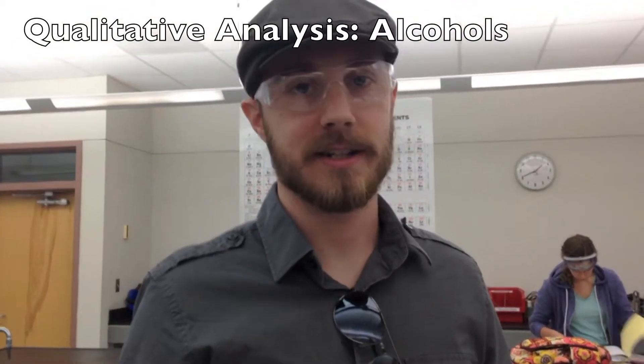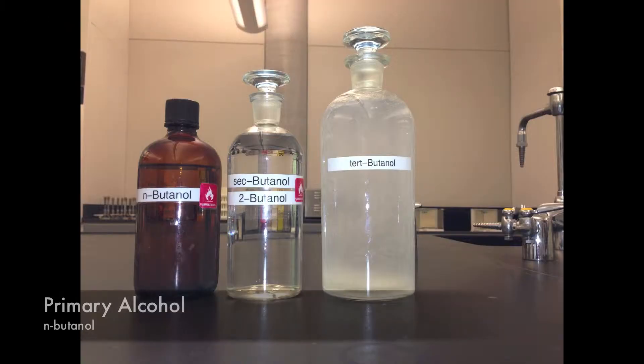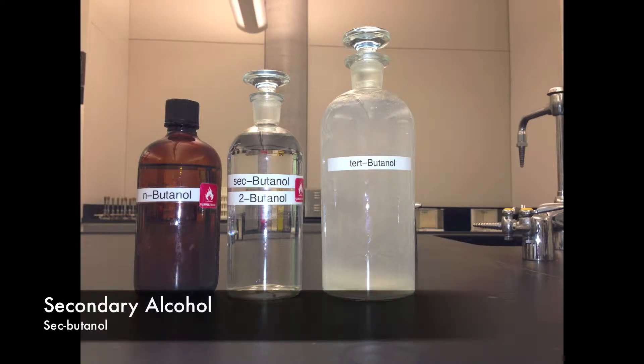What we'll be showing you today is how to differentiate between three different types of alcohols. Our primary alcohol, which will be n-butanol, a secondary alcohol, which will be sec-butanol, and a tertiary alcohol, which will be tert-butanol.